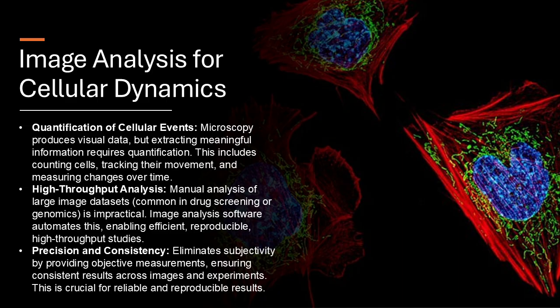Right. And image analysis can really help us study this. How so? Well, we can actually see the changes during apoptosis, like the cell shrinking and blebbing. Blebbing, what's that? Imagine a balloon deflating and little bubbles popping out. Oh, I see. So it's not just exploding. It's like a controlled breakdown.